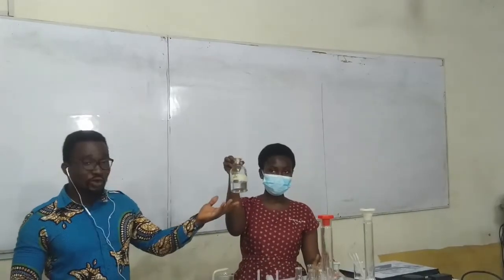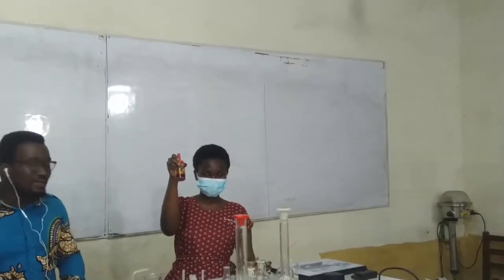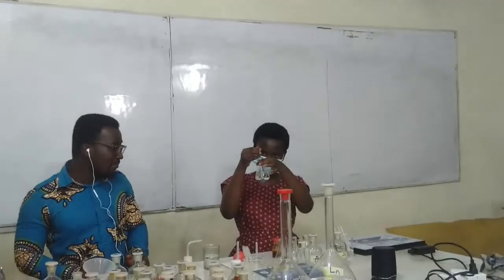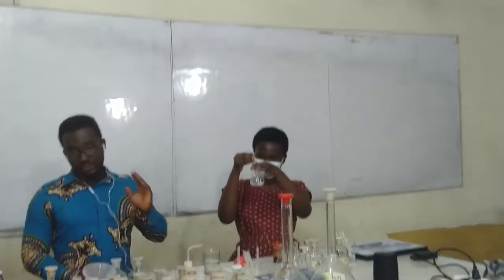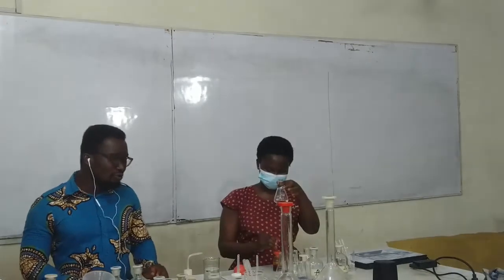So she will begin. So that is the solution. She's going to begin with solution A. We don't know the nature of the solution. She's going to first introduce methyl orange into solution A. She has already pipetted 25 centimeters cube of that portion of the solution, which is solution A. So she's going to introduce some few drops. Madam, how many are you going to introduce? She says she's going to introduce two. Okay, so she has introduced two.